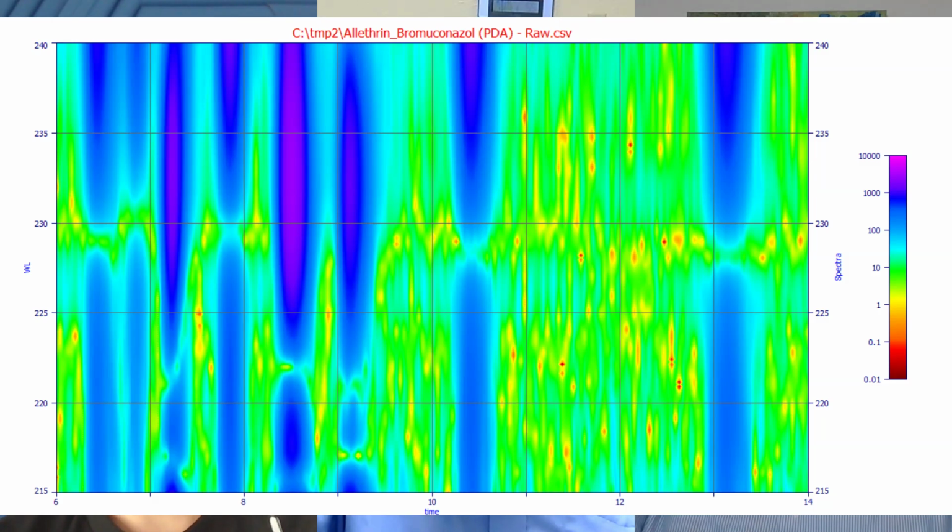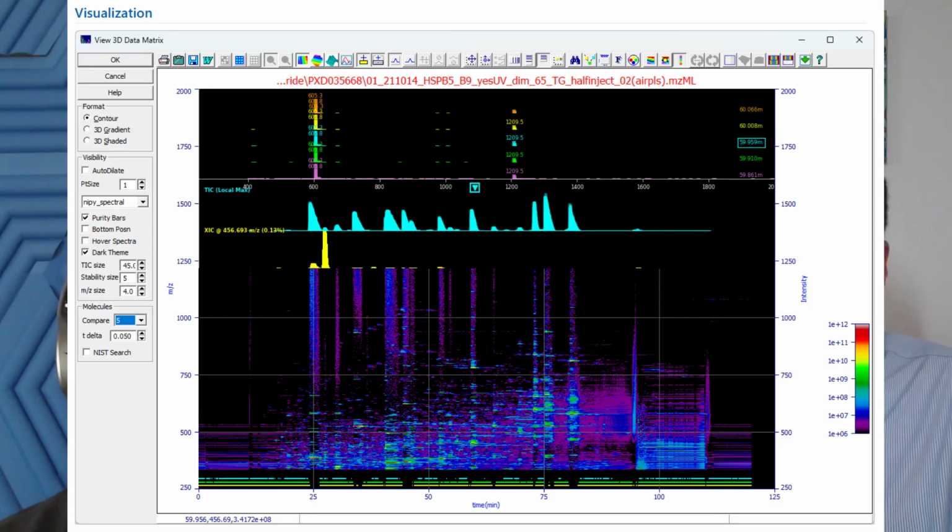Which means, if there's 2 components there at the same place, you can see this one clearly has 2 different components that are in the same place. And here you see the same kind of issue. And the thing is, you're doing something incredible, actually. You're going into finished data where it's reading one and you're basically erasing one and keeping the other. And of course, you can do that same kind of thing.